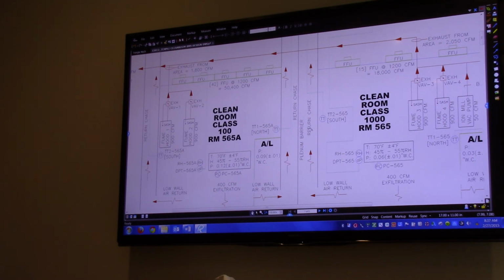I guess at this point, I don't know if you guys have finished your test, it's pretty straightforward. You could just probably leave them in the center of the table. Steve's going to demonstrate how to gown. And again, the university is going to probably dictate what materials they're going to use and their own procedures.